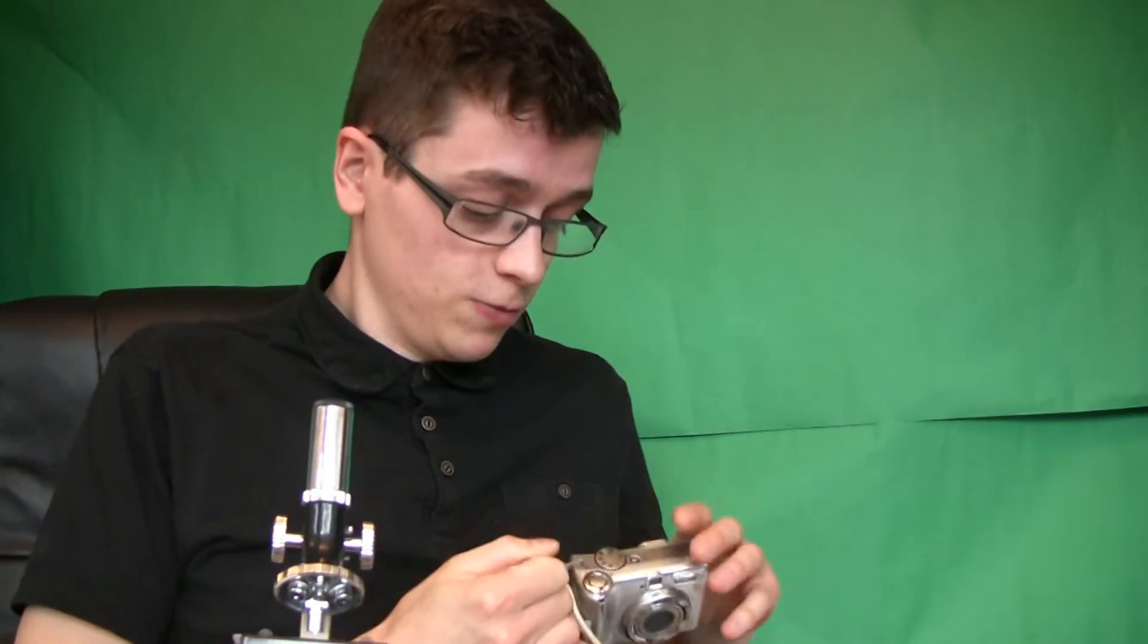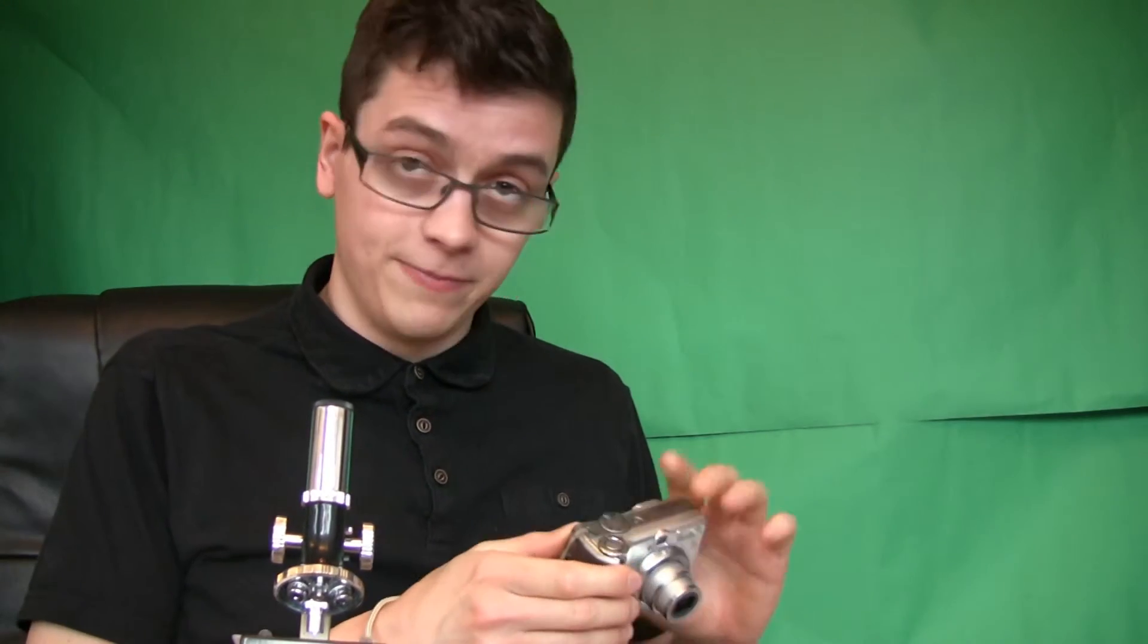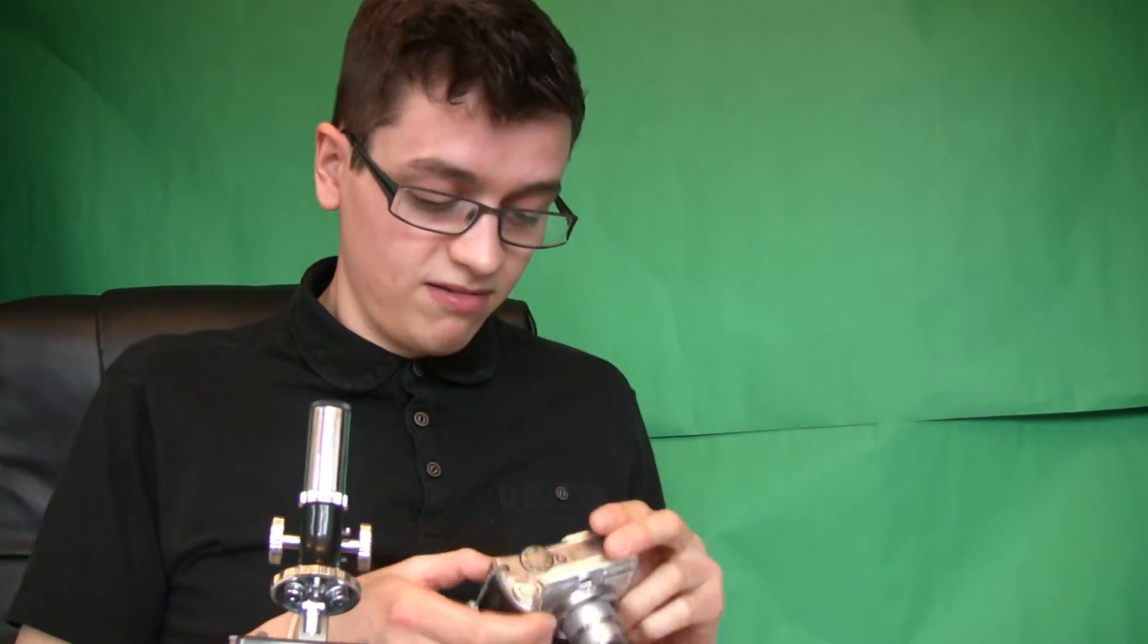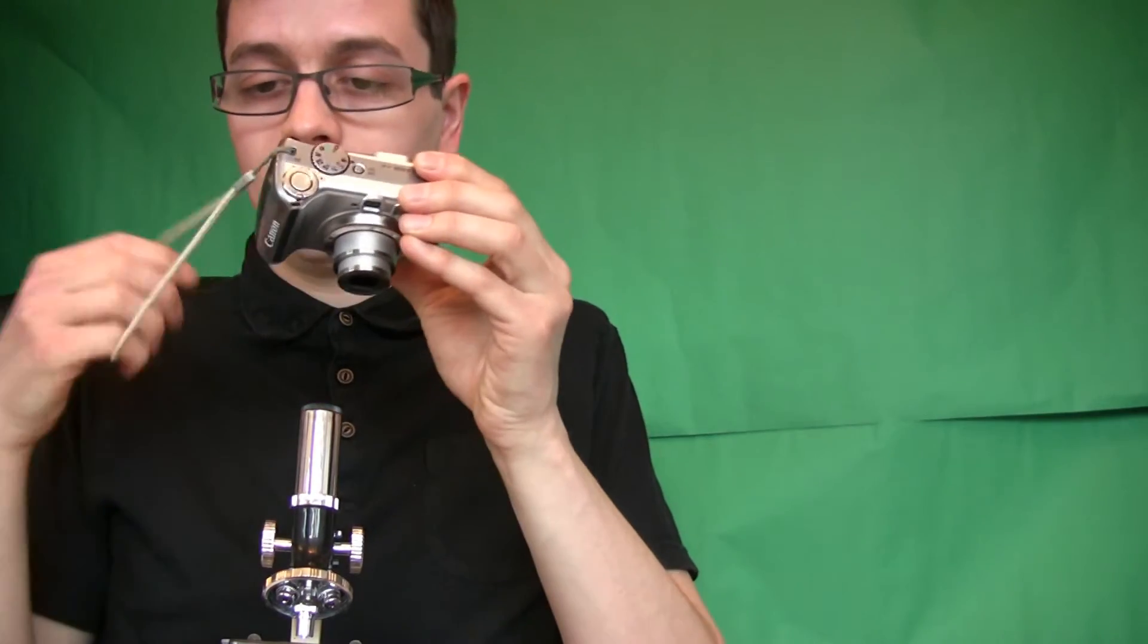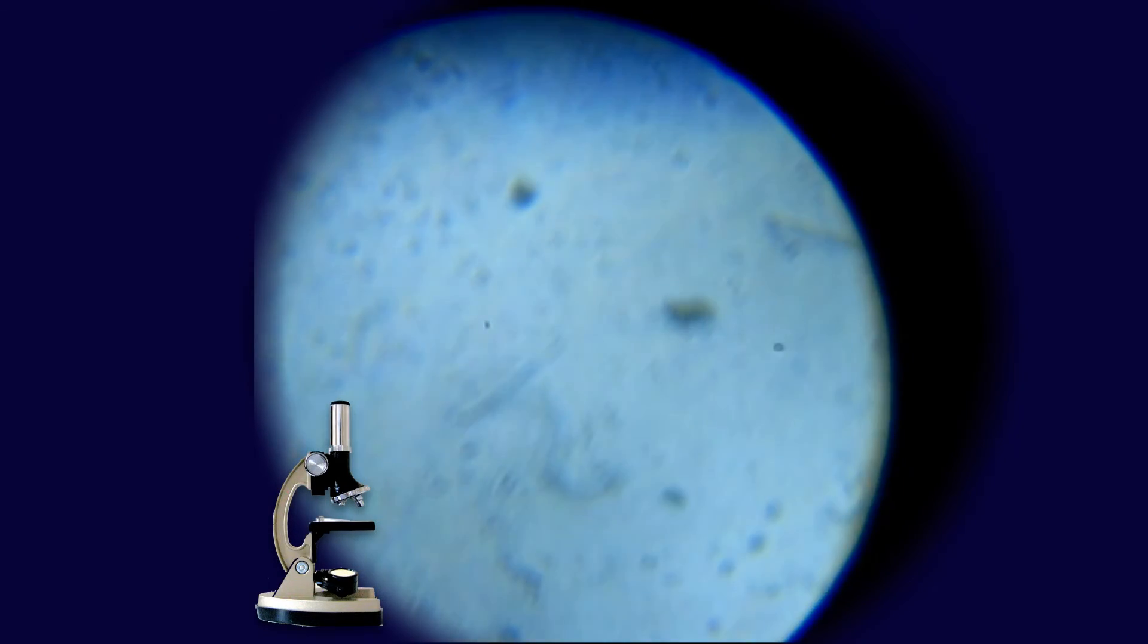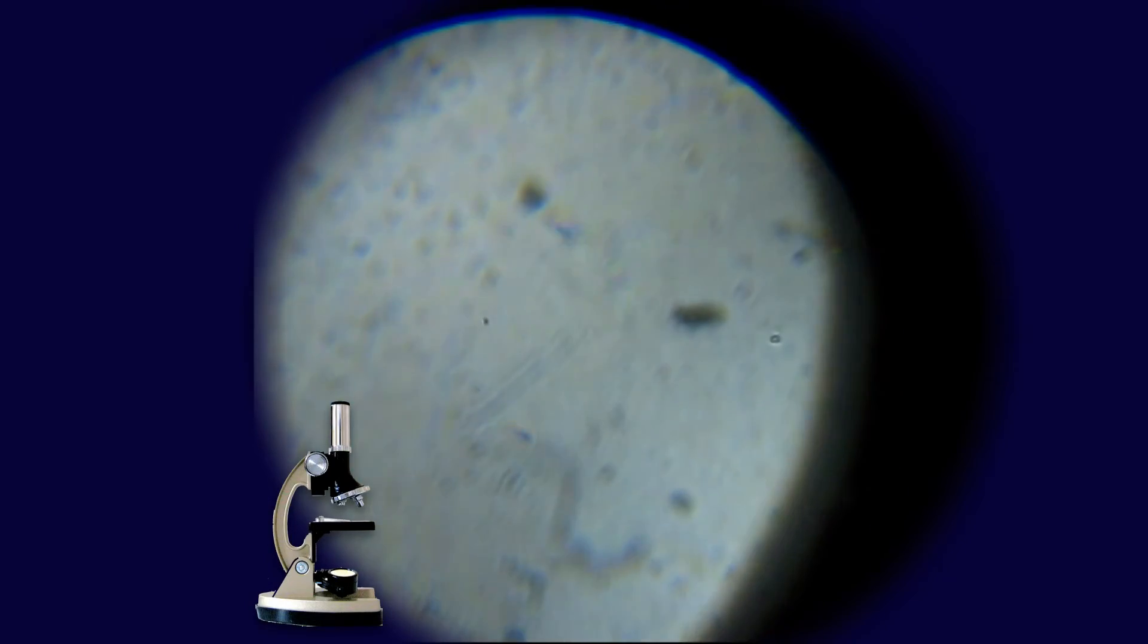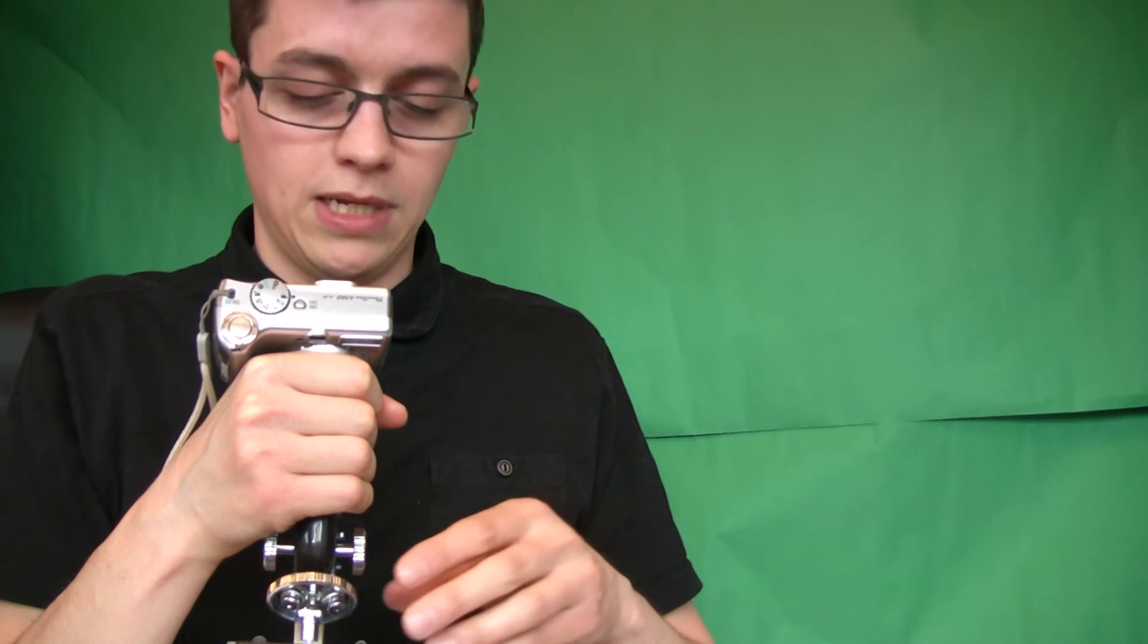I'm just going to let you know now how I actually video what's under the microscope, because I think you'll find it quite interesting. So for this you need quite a small lens, but you need to be able to zoom in to take pictures down the microscope. And for that, this normal compact camera is ideal. Set it onto video, and then I just zoom in a bit, and then I hold it so that it's pointing down the microscope. Then I can focus, change the focus, and move the slide.